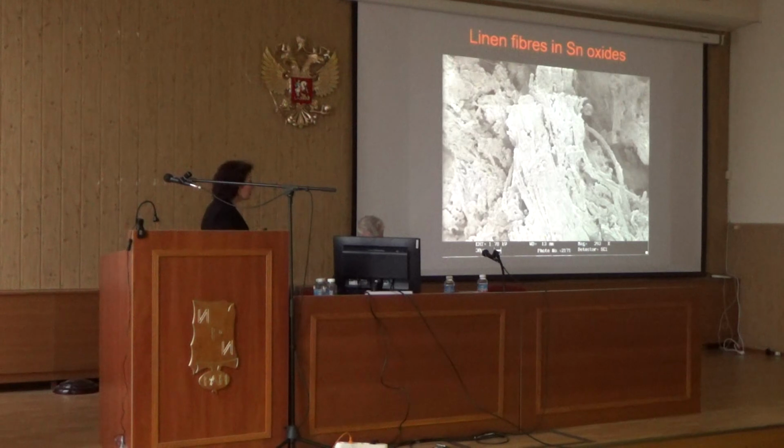In this case here, this was an ornament on wood from Bologna. It is an Etruscan Villanovan piece. It was very interesting. And in this case, we found linen fibers preserved in the tin oxides. So it's quite interesting to use, of course.